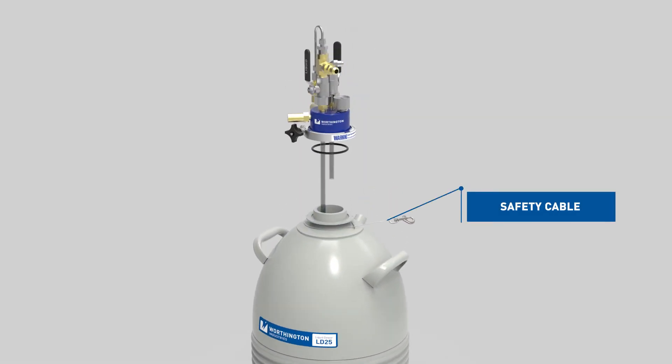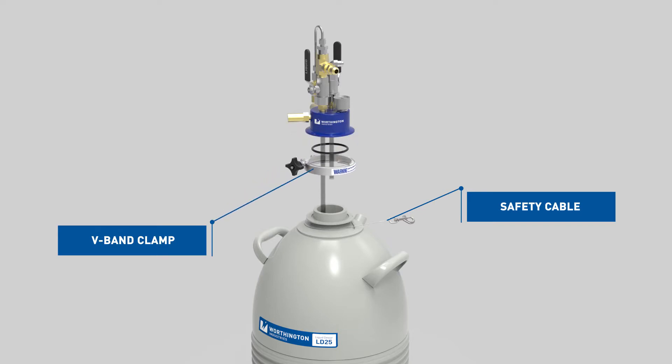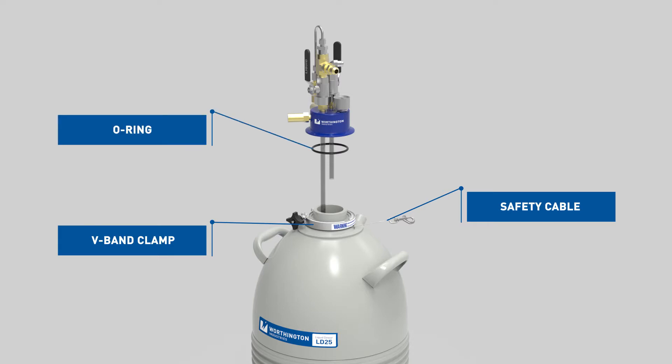Position the safety cable assembly around the top of the Dewar underneath the flange. Loosen the V-band clamp until it is large enough to remove the liquid withdrawal device. Drop the band clamp around the flange on the Dewar.